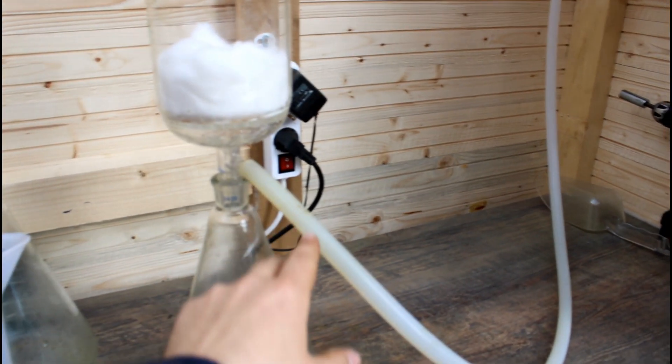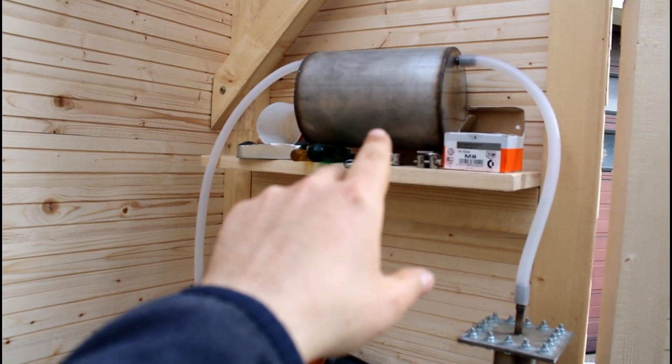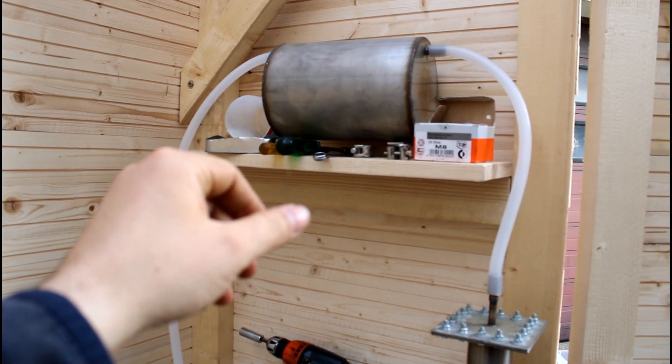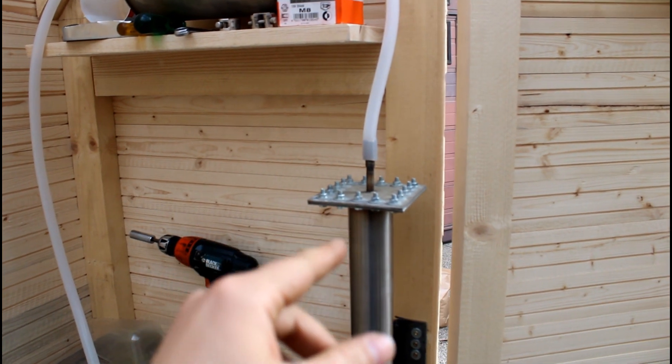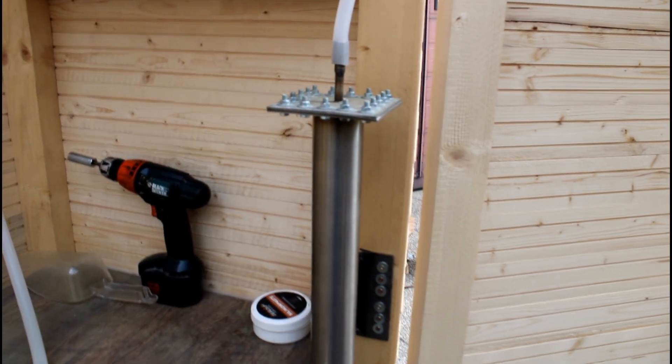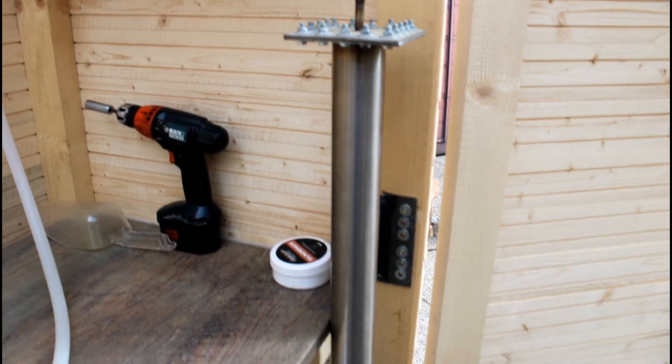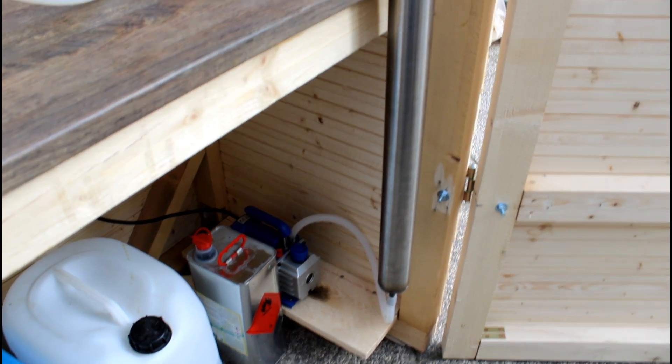And if you follow the tube it goes into a trap for excessive liquid. So for example if I accidentally suck some liquid in here it should not destroy the vacuum pump. So this is basically just a liquid trap. And in order to trap the vapors I'm using this tube here. It's filled with activated charcoal.